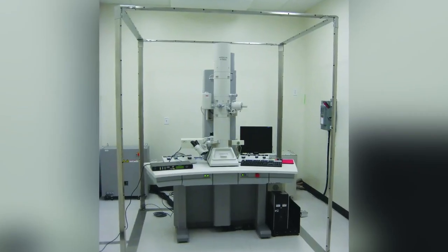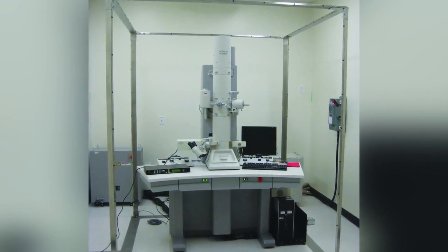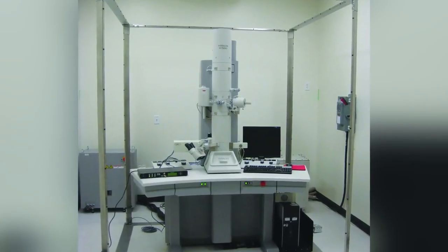Very standard design, very simple to install. But maybe we need to have a whole other discussion on that. Definitely something that we can address. And it's the same customers, the same microscopes, not optical microscopes, but the electron beam, the E-beams are sensitive to magnetic fields. And then you mentioned acoustics.